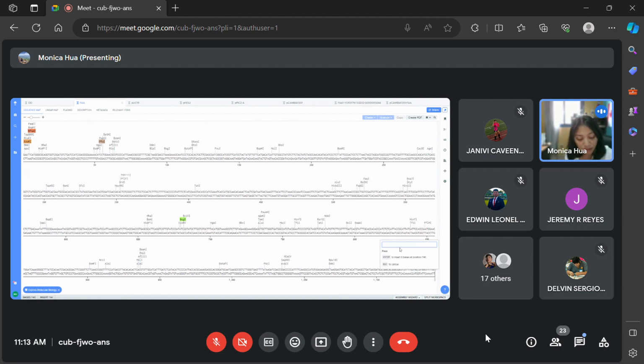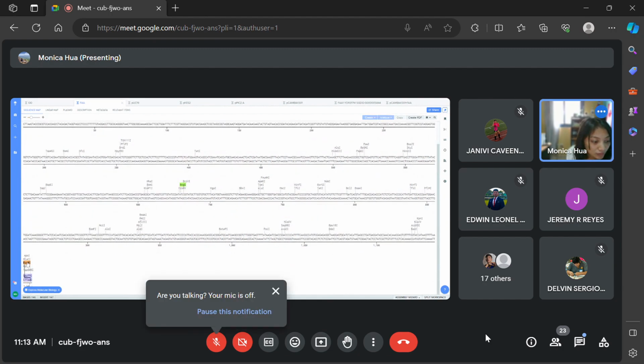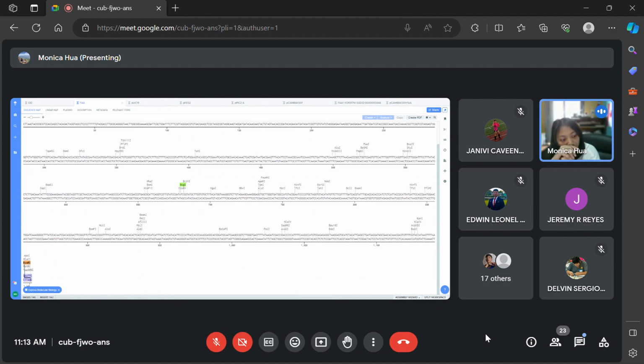Insert bases, enter. It should give you, wait a minute, TAA. Yeah, that's fine. TAA. Let me check. TAAGAAT.